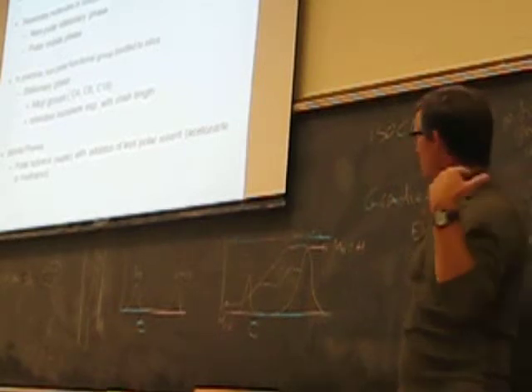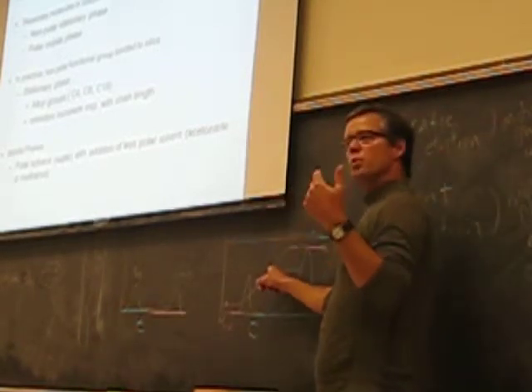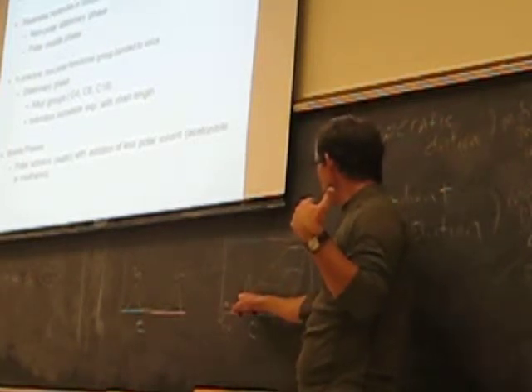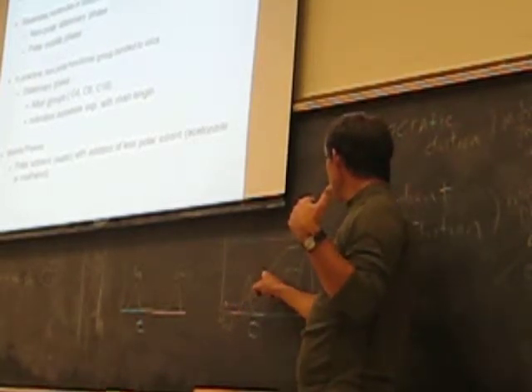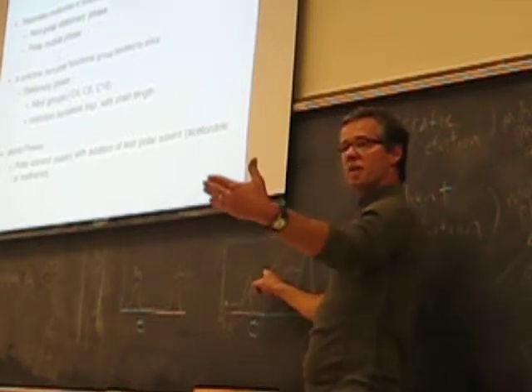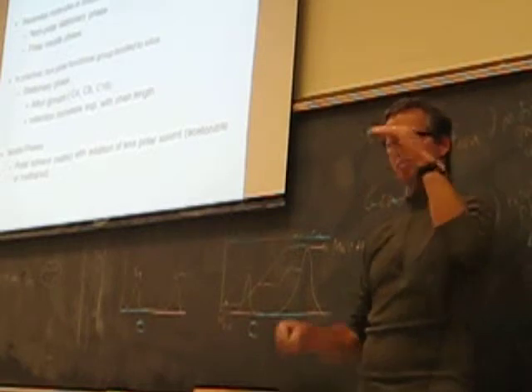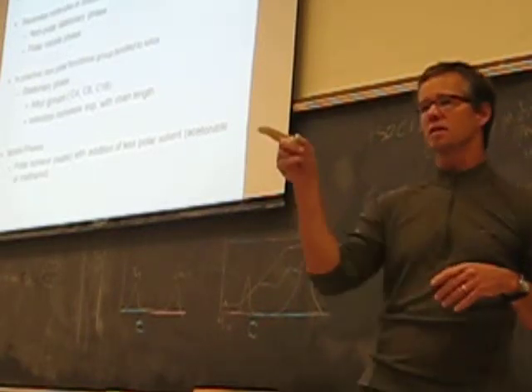And so when the mobile phase character changes, the idea about this gradient is you're trying to say, I want things that would otherwise be partitioned in a stationary phase, when I make this more non-polar, to now favor the mobile phase, and they'll elute out in some time frame. It's just based on the flow rate and so forth, typically.